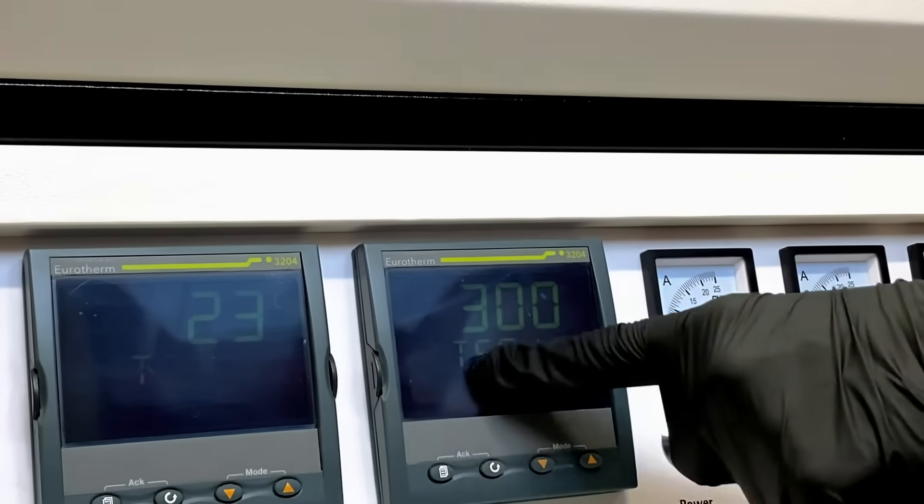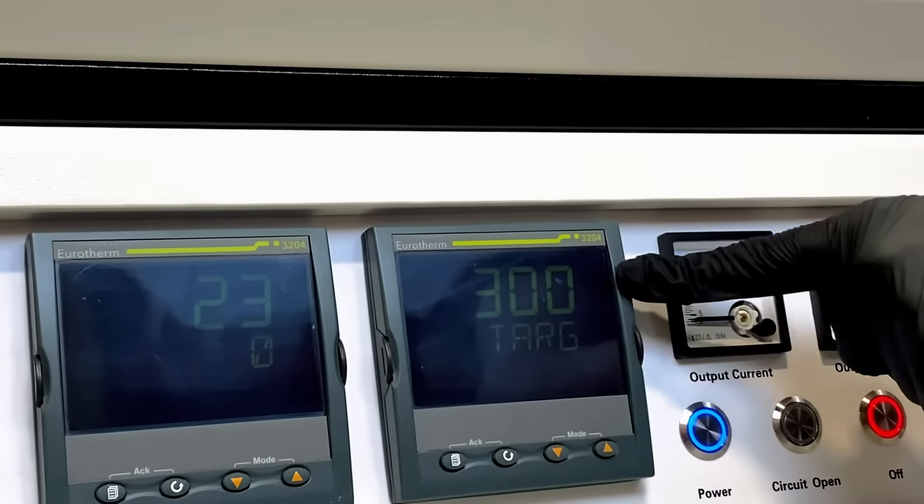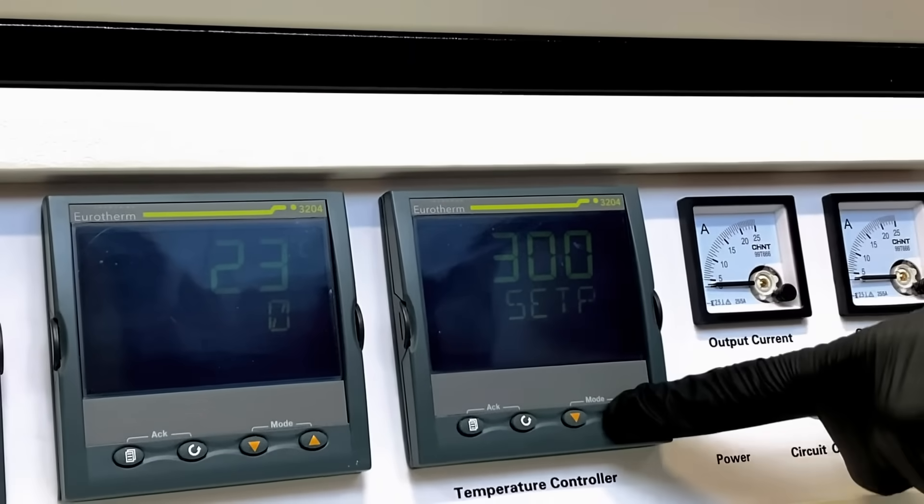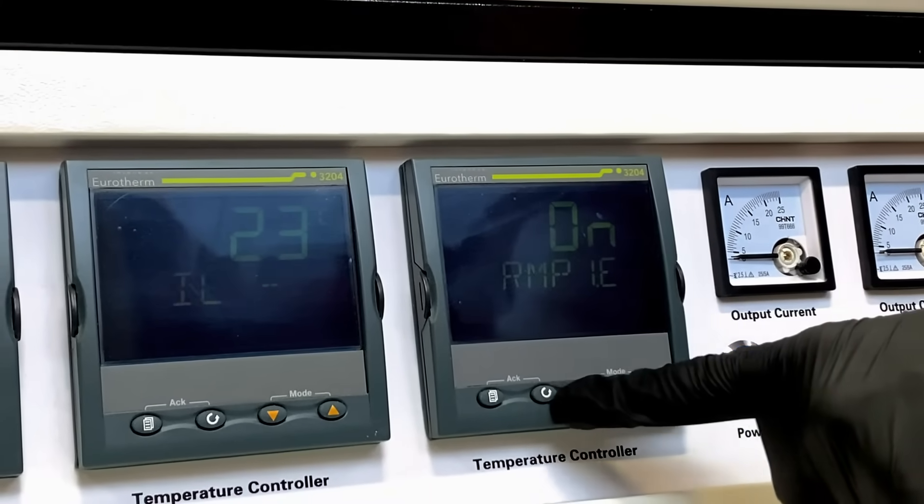This is our first selected temperature set point for the Eurotherm controller program. It is currently set to 300 Celsius. Press the cycle button to accept.